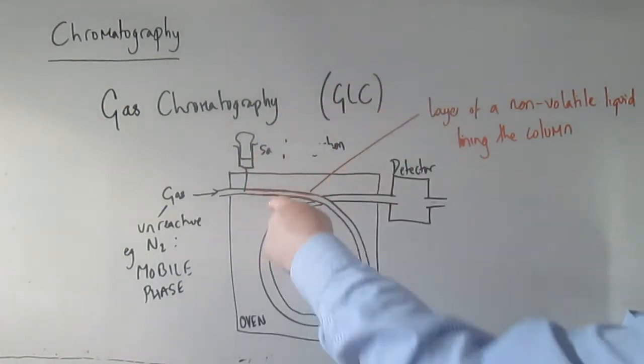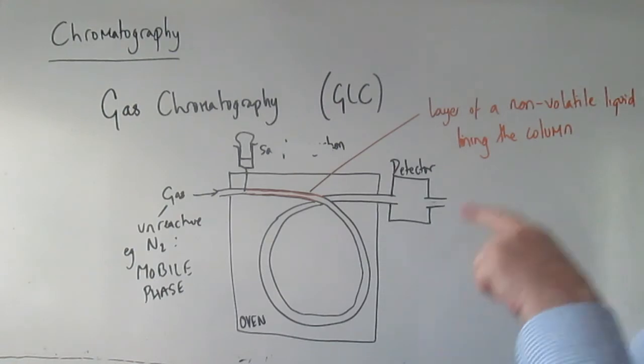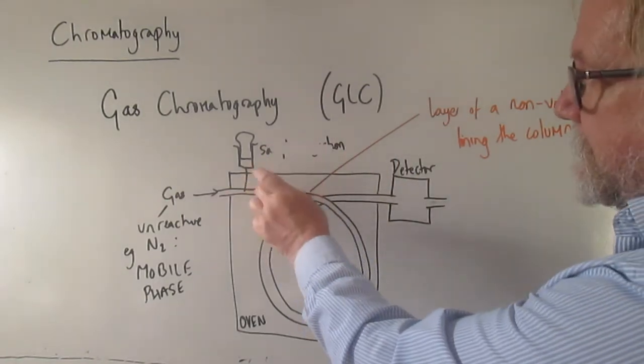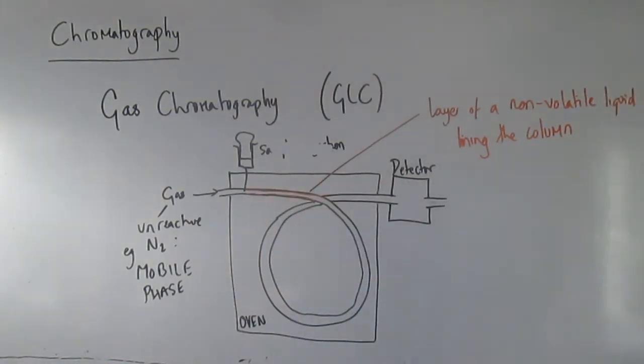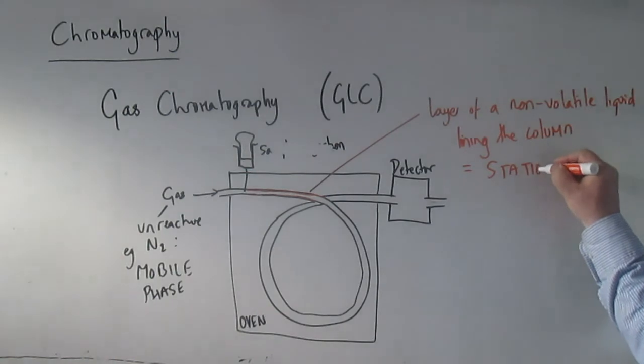Then it may go back into the vapour phase and get carried further through the column, but then it will get dissolved again and slowed down some more. And the more soluble the substance is, the more time it will spend becalmed in the liquid phase rather than moving through the mobile phase. So the non-volatile liquid lining the column is the stationary phase.